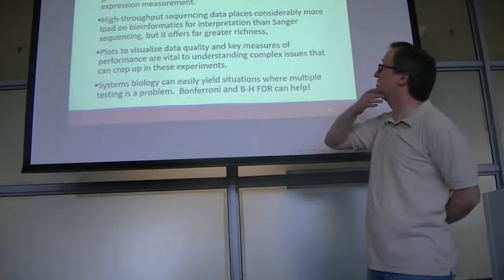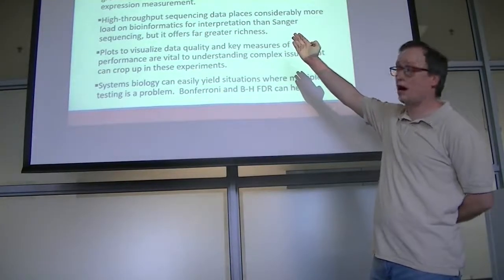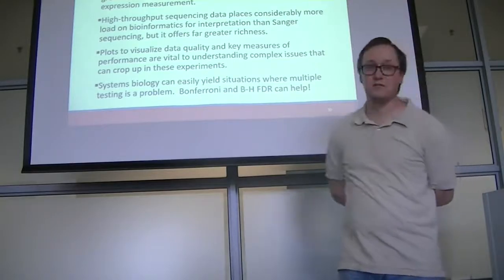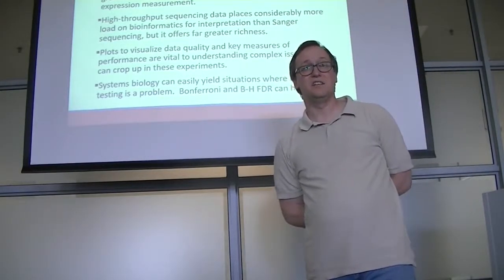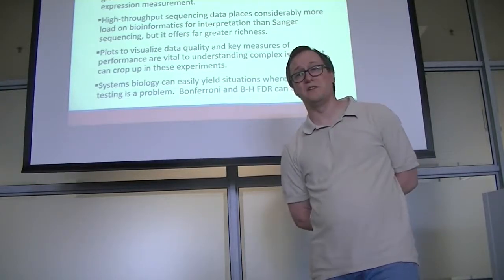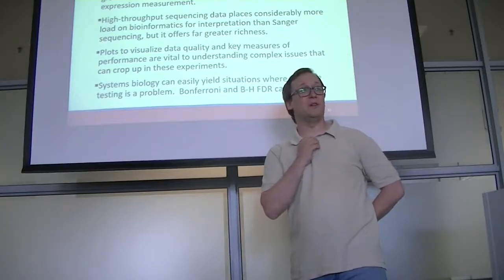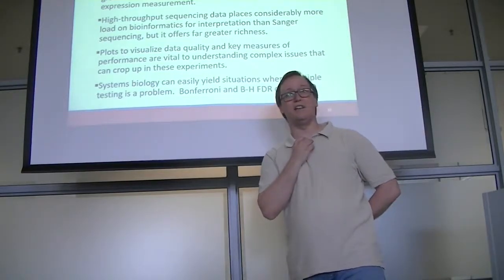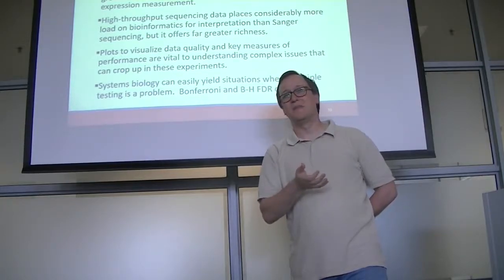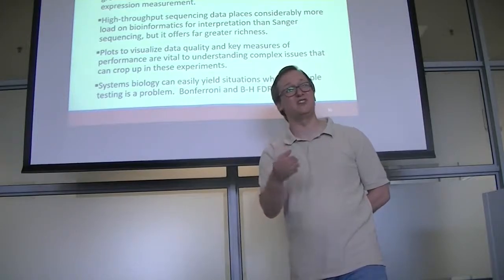So our takeaway message is, hybridization-based assays by microarray are rapidly ceding ground now to high-throughput sequencing methods, things like RNA-Seq. It's been cleaning the clock of microarrays for most research purposes. That said, microarrays are still a much less expensive, much easier analyzed way to get at gene expression. So just because RNA-Seq is available does not mean it makes financially the best sense.